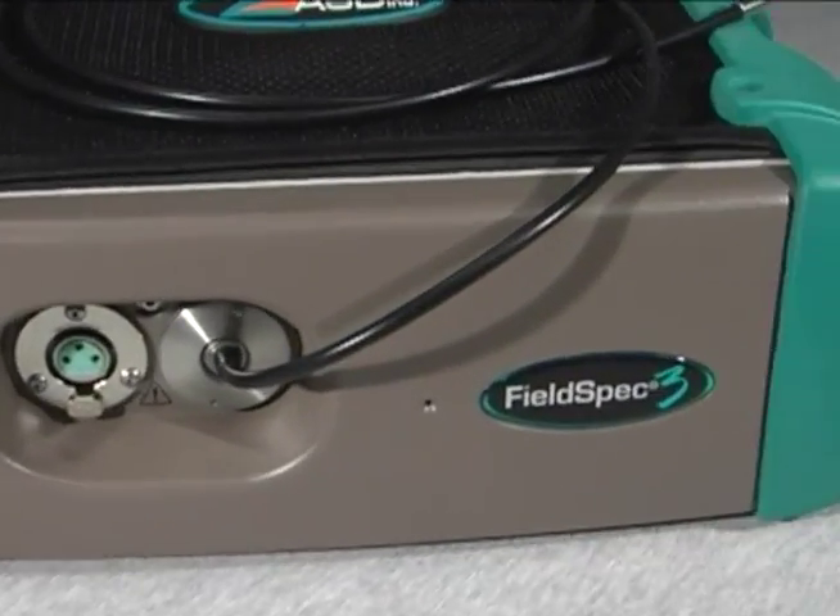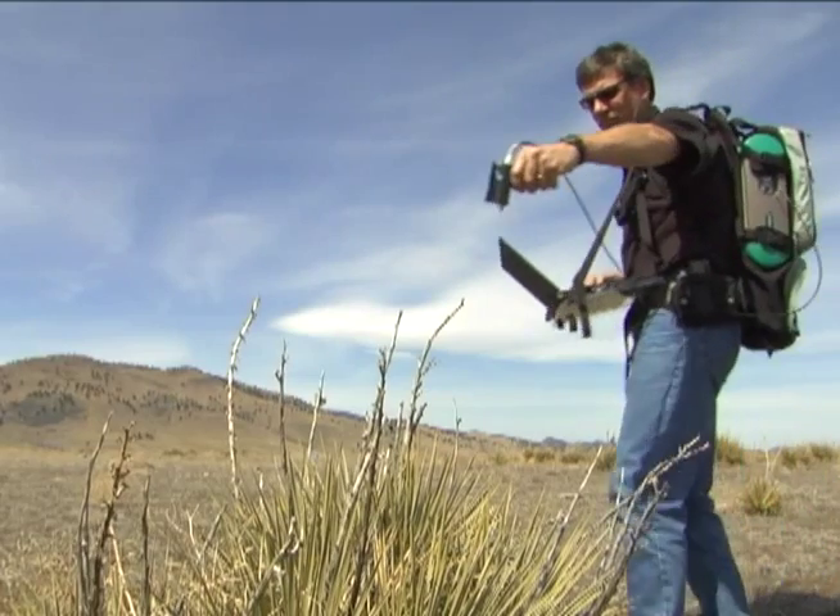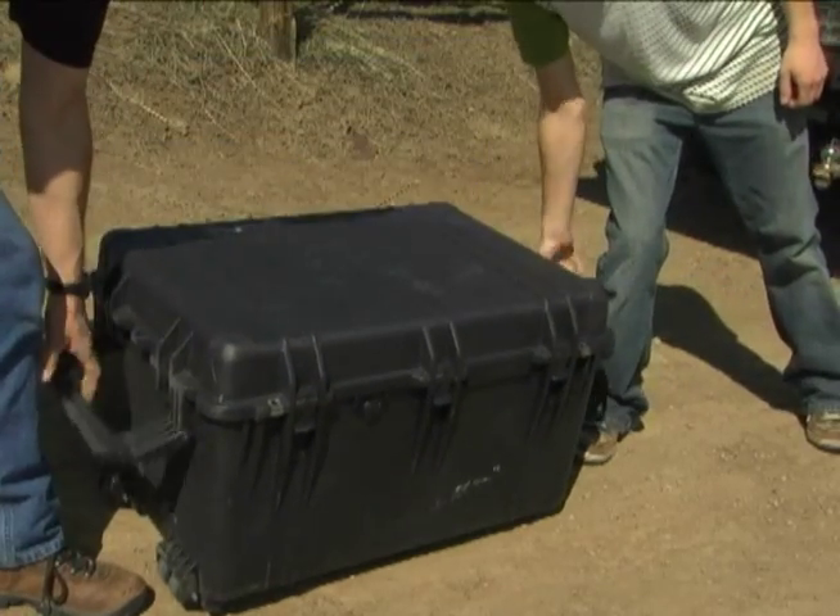Our instruments are rounded, easy to carry, not a lot of sharp edges — the kind of thing you'd want to put in a backpack and take into the field. They're rubberized so that you can bounce them around a little bit. People bang this around running in trucks and everything. We even have pictures of our instruments on camels in the Nubian desert. It is the lightest and most portable instrument out there.